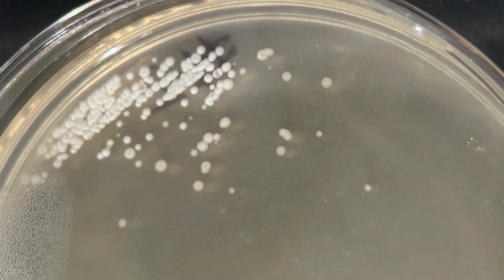Well, I painfully found out this isn't true and I probably should have researched better. After less than 24 hours, the first plate I labeled to take out had growth, and I didn't believe it because I hadn't planned to take it out till the third day. And it just looked like some random fungi, so I wrongfully assumed it was just contamination. But little did I know it was actually Streptomyces. And on the second day, I noticed that every single plate had these colonies, and I knew I had messed up immensely.